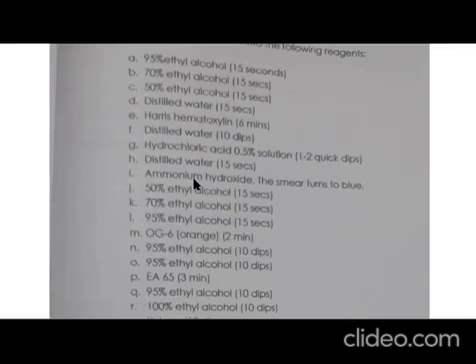Si hematoxylin. Okay? So, ang mangyayari dito, after natin ma-immerse in ammonium hydroxide, yung nucleus, no, ng cell, from red, magiging blue siya. Sir, gaano katagal ang ating pag-immerse or ating pag-dip sa ammonium hydroxide? Hanggang sa may ma-observe na kayo na tinge of blue.